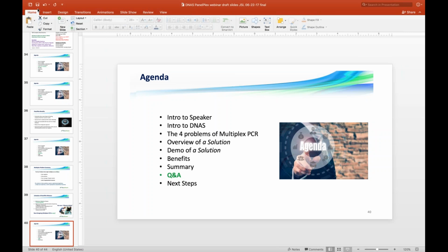Okay, Rod has 3 questions. I don't know which one I should answer because we don't have time to do all, so I'll go to the 3rd question. How do you support the design of assays, including internal amplification controls? In both of the projects I just mentioned, internal amplification controls was one of the members of the multiplex. And I didn't mention this, but you can implement the control as a fixed part of the design.